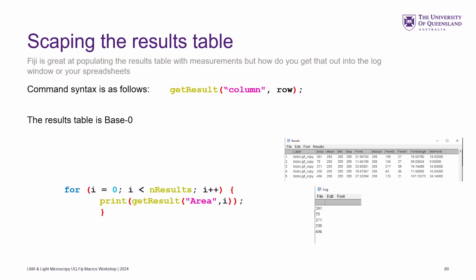Because you might want to have channel 1's area and channel 1's mean intensity and channel 2's mean intensity. So if you wanted, you could totally just select your image, channel 1, run measure on all the things, save this as a table, and then go to channel 2, clear this, print it again, and end up with 2 spreadsheets you then have to open and find the mean column, copy that, and put that into a new Excel spreadsheet, for example.